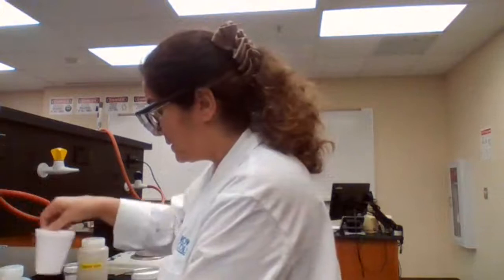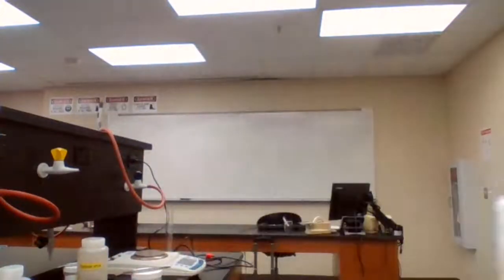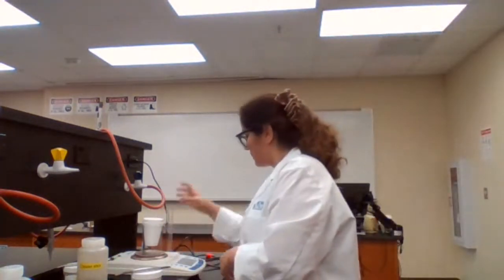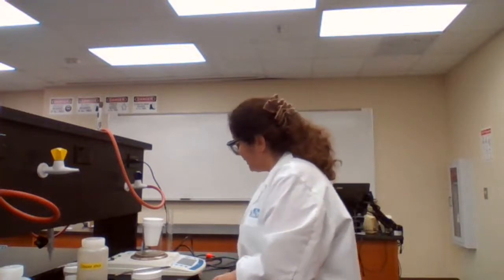Going to take out, keep it on the side. 170.387 gram.